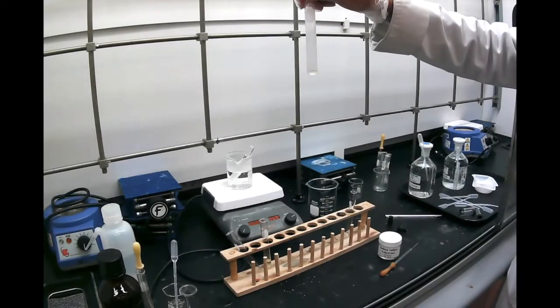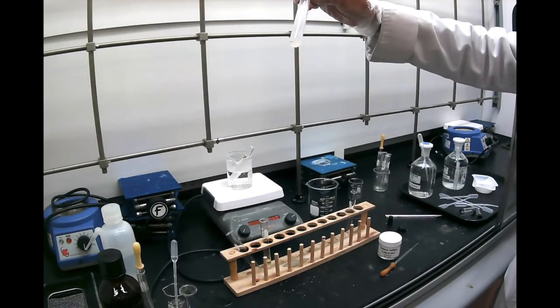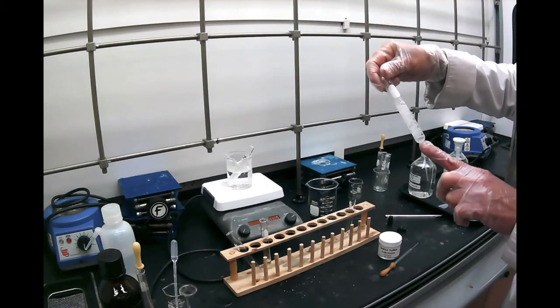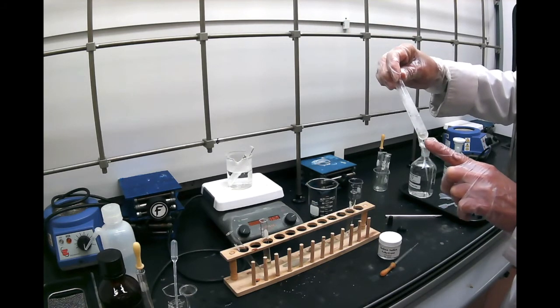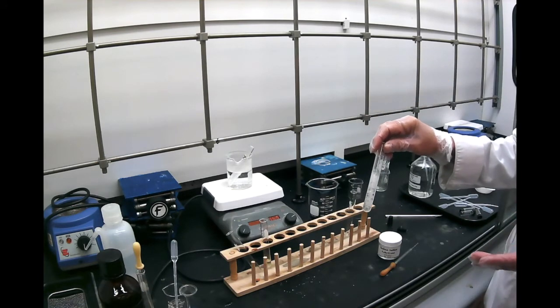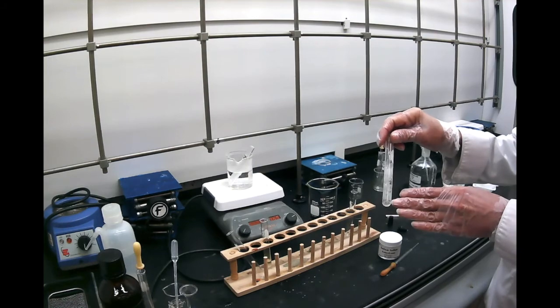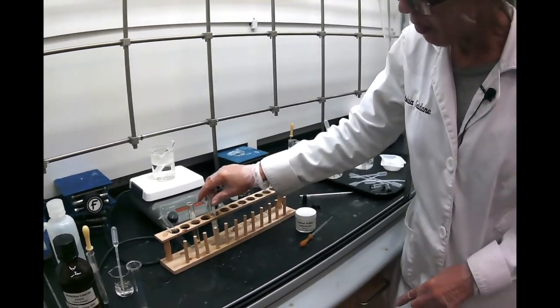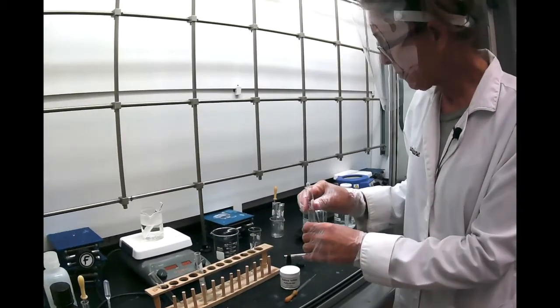And 100 milligram is not a lot, and you start already to see that there is quite a few crystals. I also see that I have a little bit of the methylene chloride. That would be a good thing to write down when you write your discussion. If you took a little bit of your organic layer here, you're probably going to lose a little bit of mass of the benzoic acid in here.